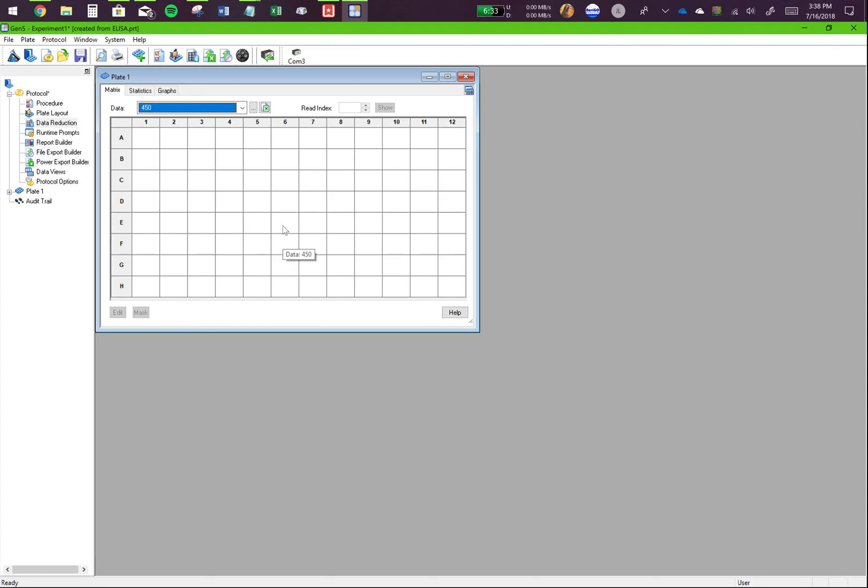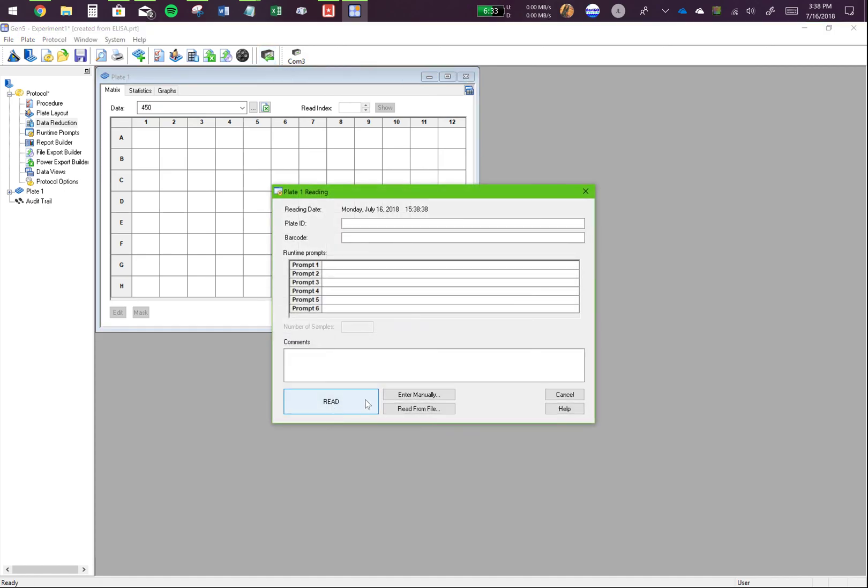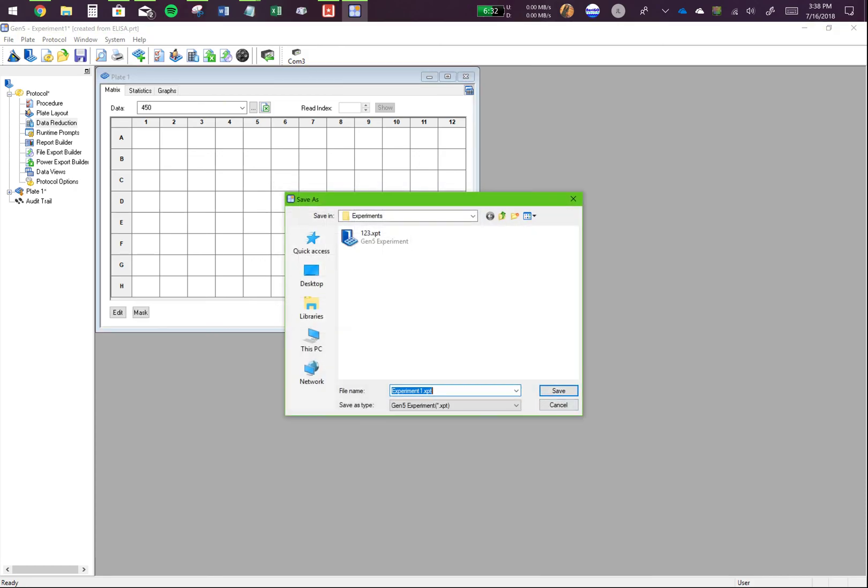Now you're all set. Have your spectrometer turned on. Make sure your plate is ready. Click on read plate. All of this is optional. Click on read. Insert your plate. Yes, make sure you know where you're saving your result file and name it accordingly how the previous files have been named.